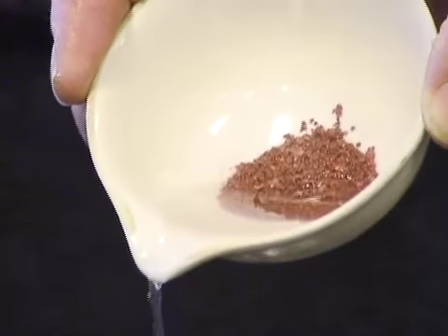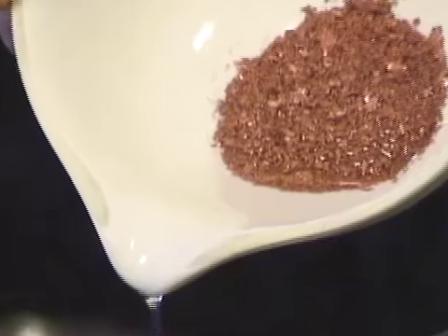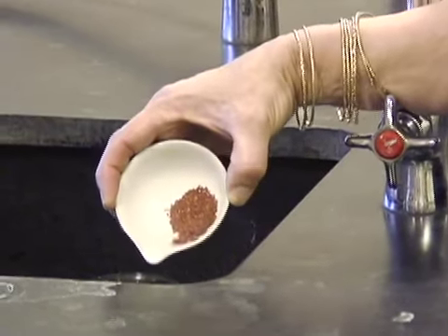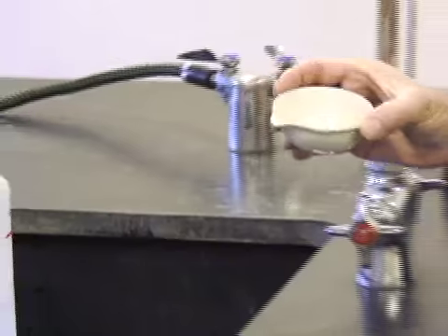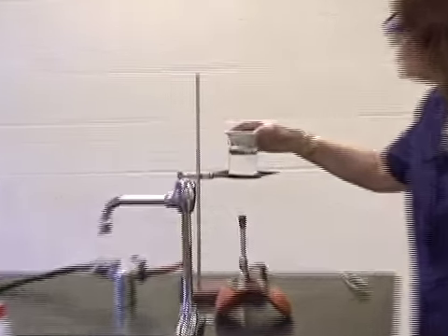Acetone, as you know, is fingernail polish remover. And nicely poured off. Now, I want to get off as much as I can because we know it's very, very flammable. There we go. And now I'm going to put it on a steam bath to dry it out.